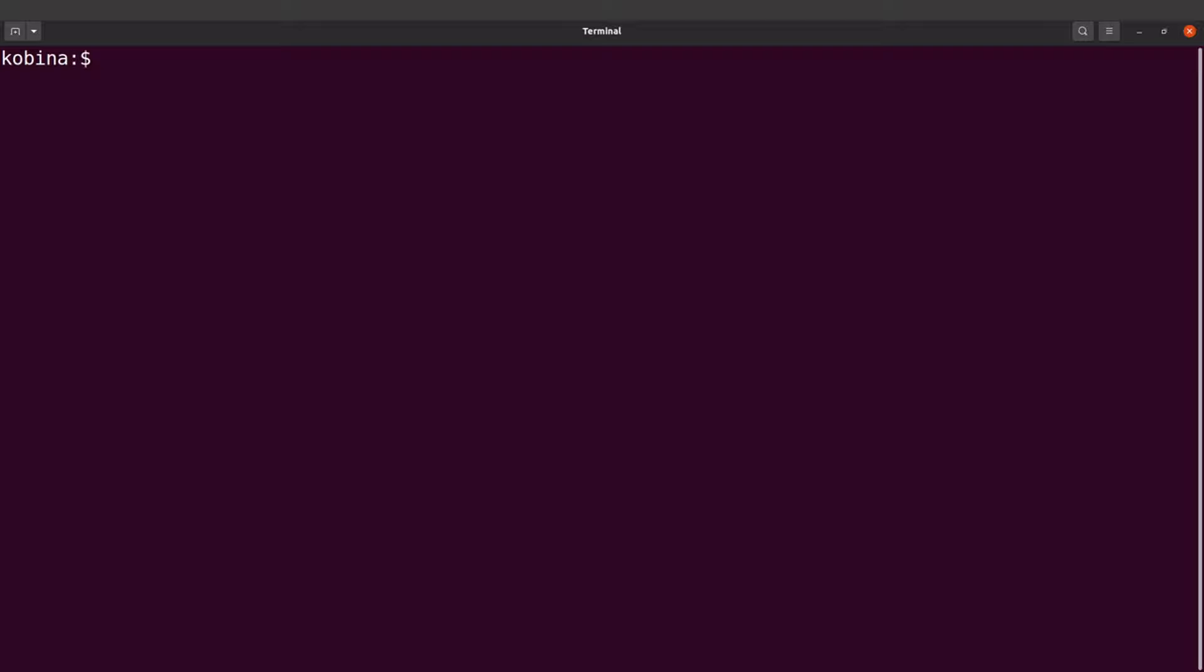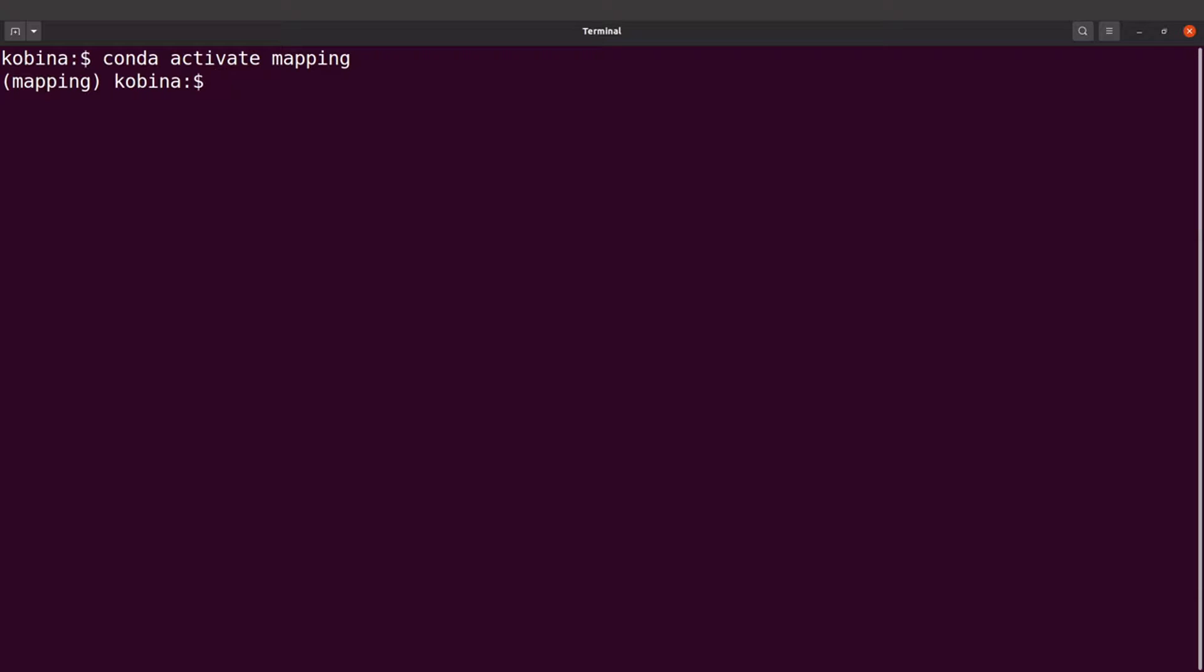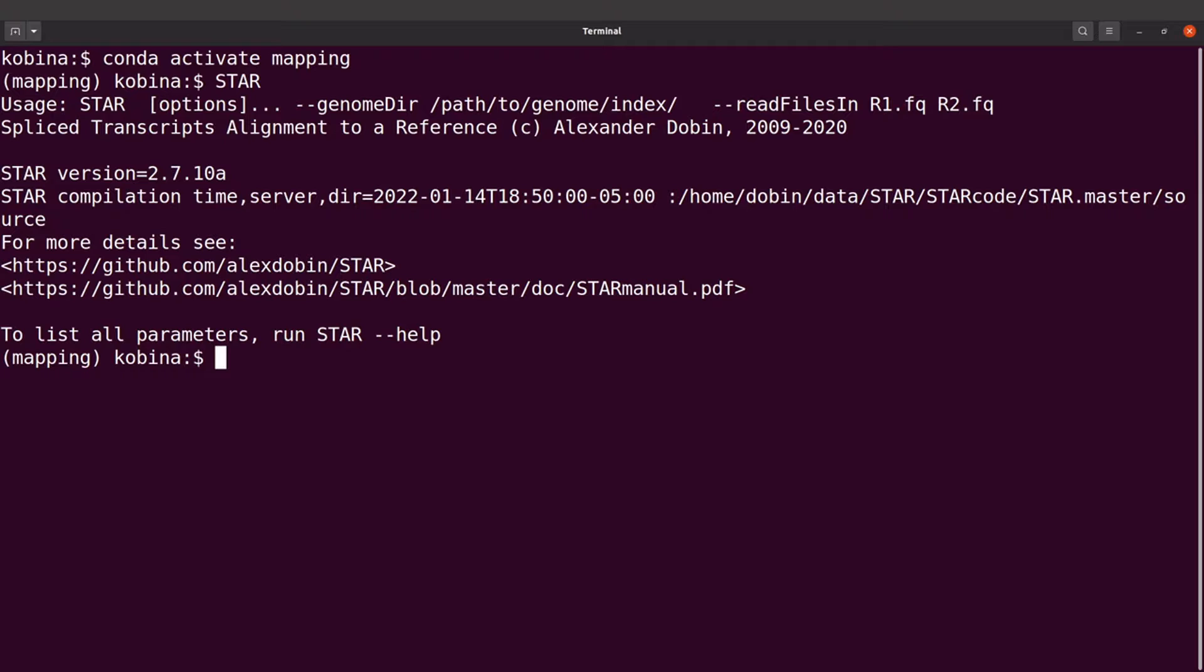And therefore we need to activate the environment. So we say conda activate and you indicate the environment's name. In this case mapping. So now we can call STAR. So we can say STAR. And this will give us an output.